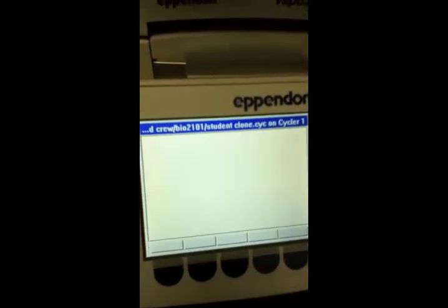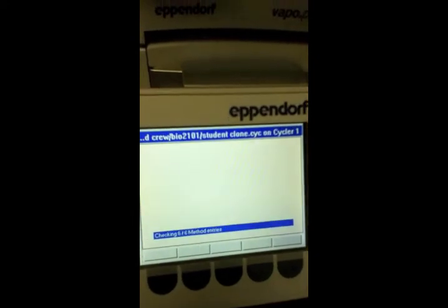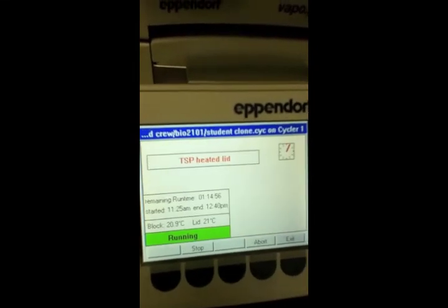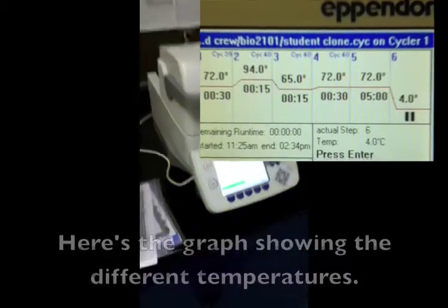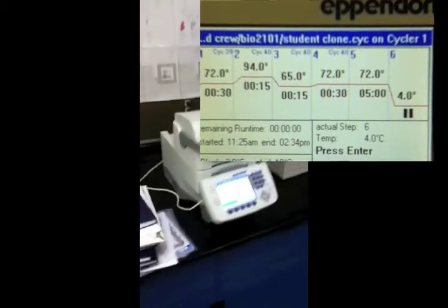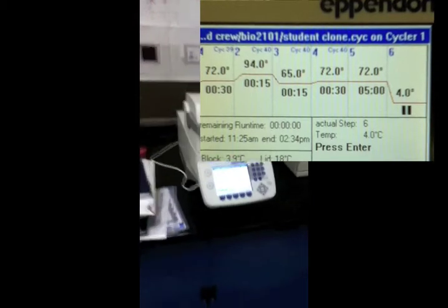So we're going to start this cycle. Does it show the graph, though? It will show the graph in about 4 minutes. Well, number one is first cycle. We're going to go 40 cycles.